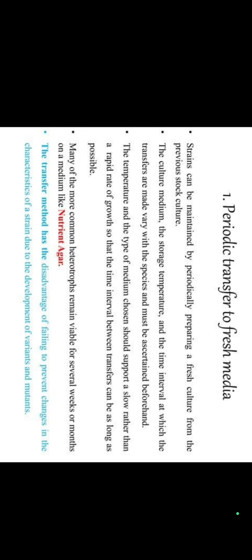The transfer method has the disadvantage of failing to prevent changes in the characteristics of strains due to development of variants and mutants. Advantages: it is a simple method. Any special apparatus is not required. Easy to recover the culture. Disadvantages: the risk of contamination is more. It may be possible to change genetic and biochemical characteristics.